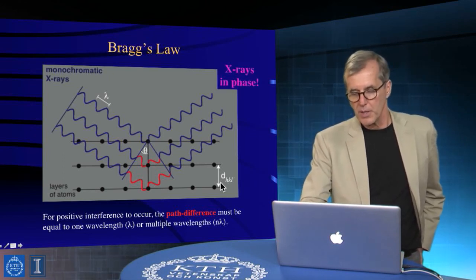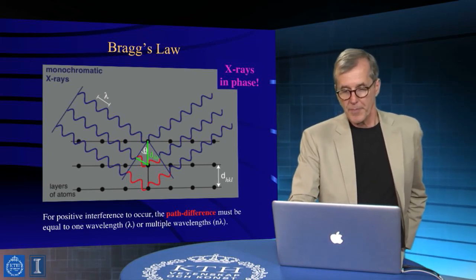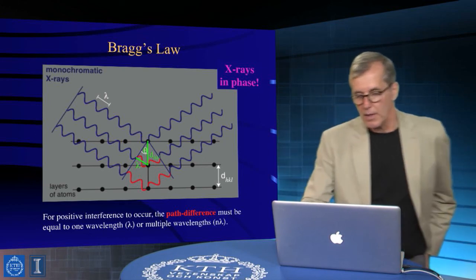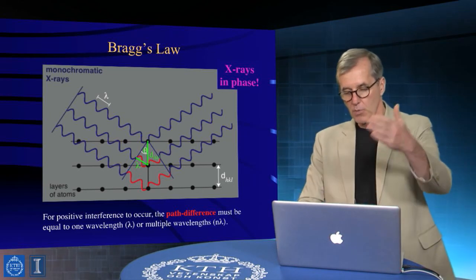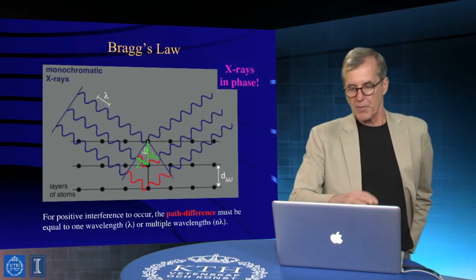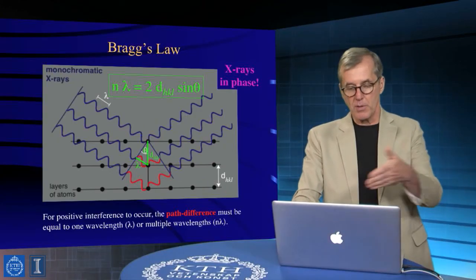Okay, and to look at how that all plays out, the X-rays are in phase, right? There's a characteristic distance that corresponds to this so-called d spacing, right? And there's a characteristic distance that corresponds to the wavelength. At that particular angle, that one characteristic wavelength then has a spatial offset that's distance d from the scattering plane, 1 unit up at that characteristic d spacing. Right, and so that's the fundamental attribute here. In point of fact, these path differences must correspond to one wavelength or multiples of one wavelength. So lambda or n lambda.